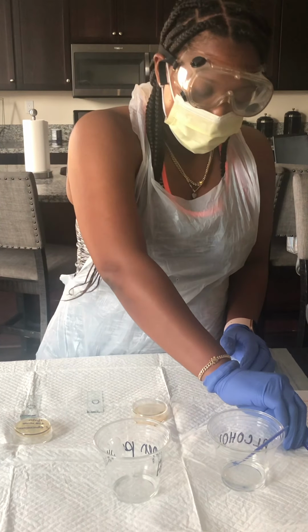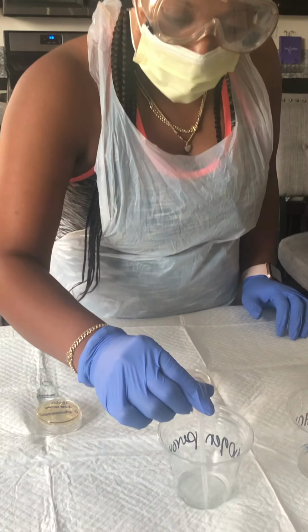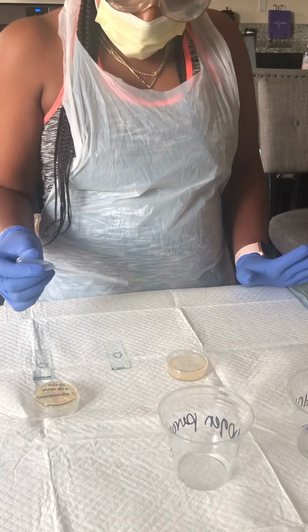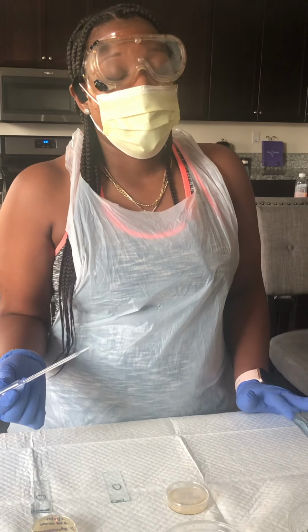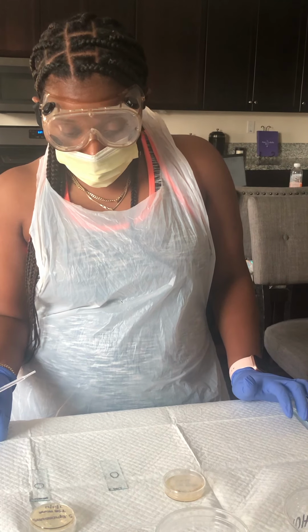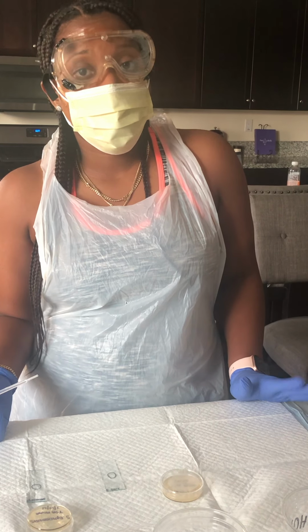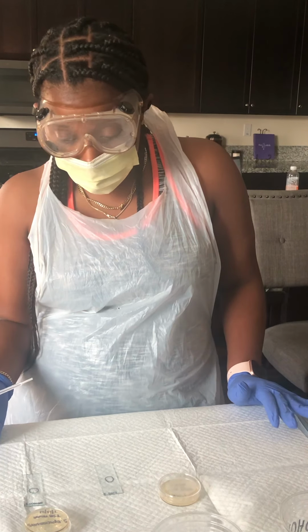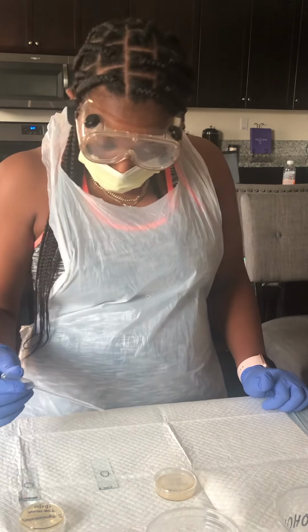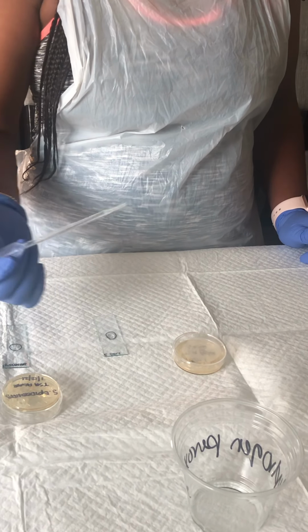Okay, place that to the side, and now we are going to apply 1 drop of our hydrogen peroxide onto our slide. And if we have any bubbling, any oxygen bubbles, that's an indication that it is positive. If we don't see any oxygen bubbles visible on the slide, that is an indication that it is a negative sample. So now we're just gonna apply our 1 drop there.